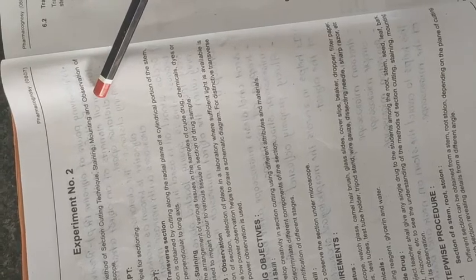In this experiment we have to study the cutting techniques, that is how you can cut your section; staining, that is which type of staining reagent you have to use; and mounting and observation, that is how you can prepare your slide to observe under the microscope. These three things we have to study in this experiment number 2.